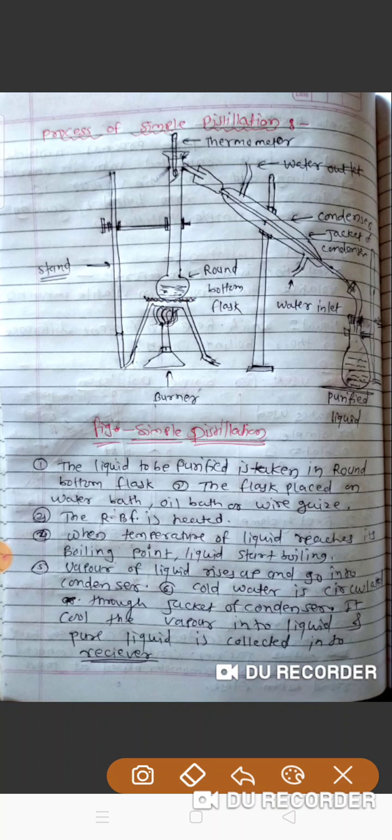Now consider the process of simple distillation. The liquid to be purified is taken in the round bottom flask. The round bottom flask is placed on the water bath, oil bath, or wire gauze, and then it is heated using the burner.